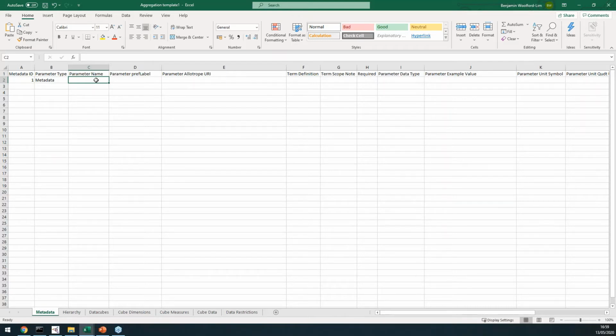Tabular models tend to record, to date, they've tended to focus on the results of an instrument. So usually the first pass of a tabular model goes through the reports of a couple of different instruments in a space and pulls out all of the different parameters that go on that report to say, okay, this is what we're going to capture. So the parameter name field here is basically meant to be more or less the manufacturer's parameter name. This is what it says on the report.